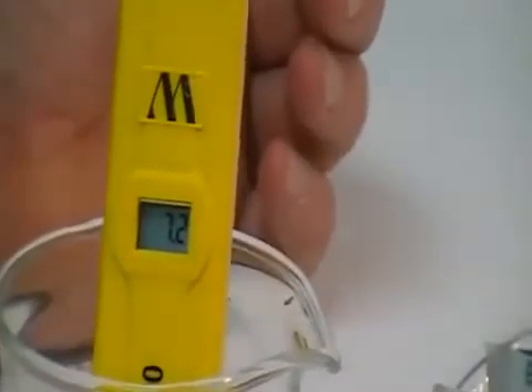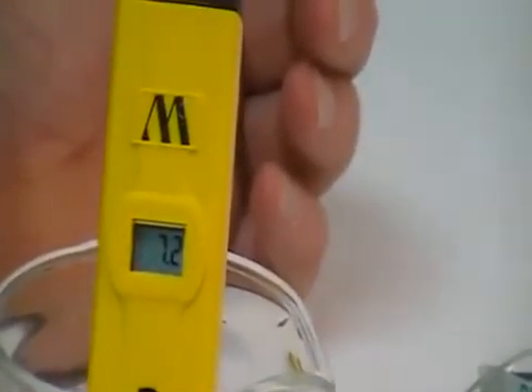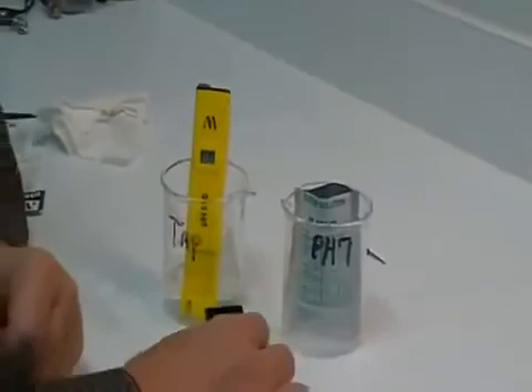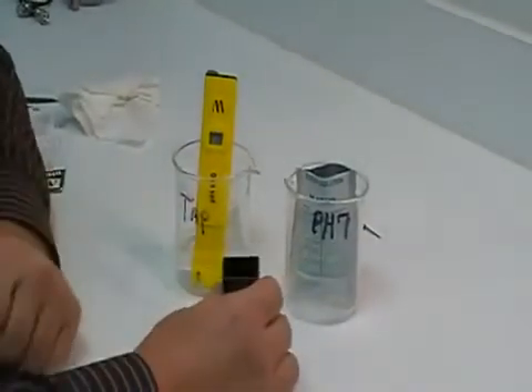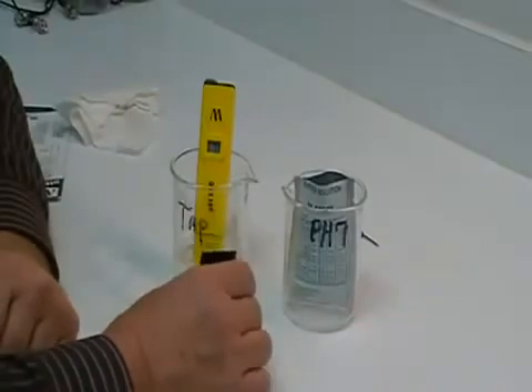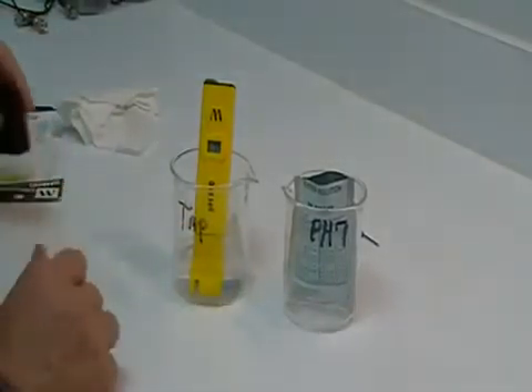That concludes the calibration for the PH600. Always keep the probe wet at all times. If you're going to use the black cap for storage or traveling, make sure that you put a chip of sponge in the bottom of the cap. Never let your probe dry out. Thank you for choosing Milwaukee Instruments.